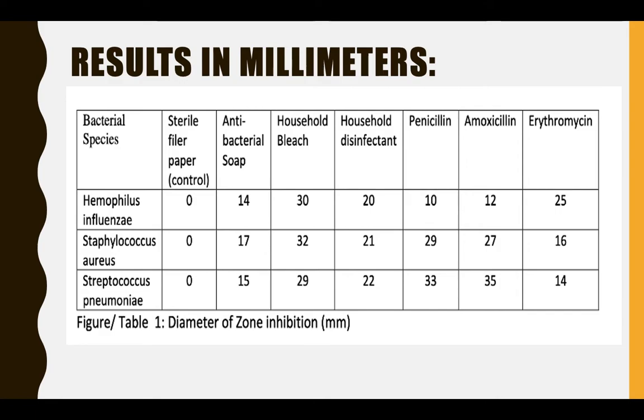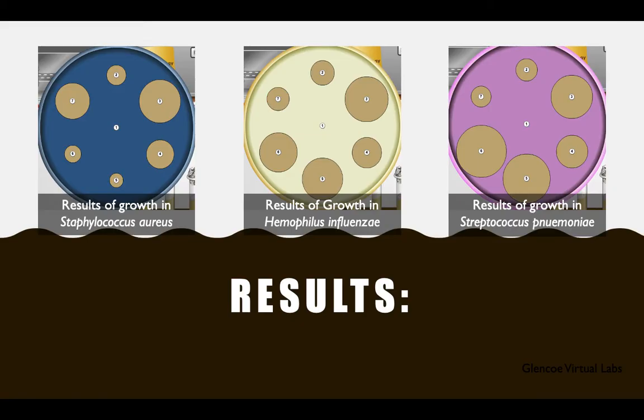So based on the results, we can conclude that the different antimicrobials showed varying degrees of inhibition, and this is due to the contrasting characteristics of bacteria and its resistance to certain substances. As you can see from our cultures and the chart, neither one of the bacteria were fully resistant to any of the antimicrobials. All diameters had at least a minimum of 10 millimeters, with only 4 of them reaching into the maxes of 30 or more.